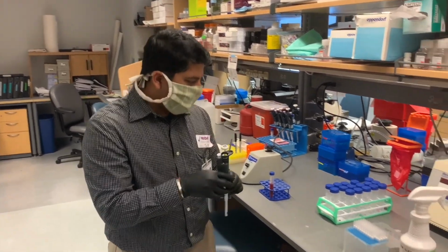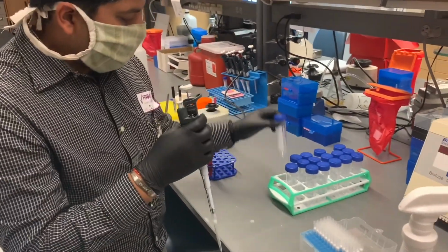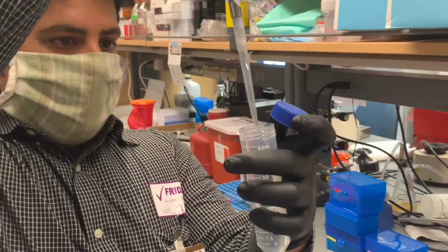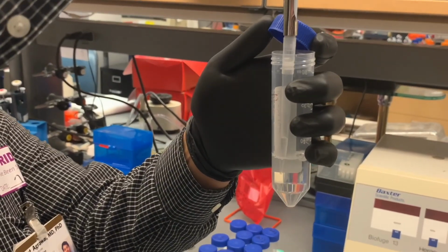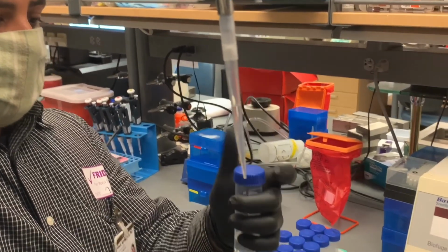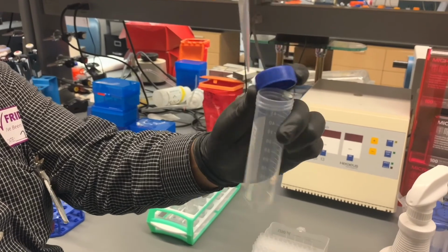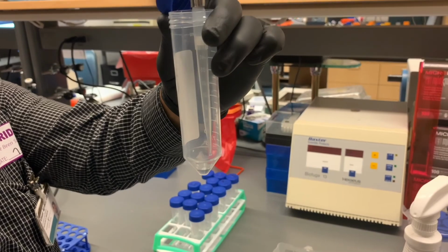For example, if we wanted to transfer 0.5 milliliter fluid from one tube to another, what we would do is pick it up with our pipettor, and you can see it's in our pipette tip, and carefully pipette it into another container.